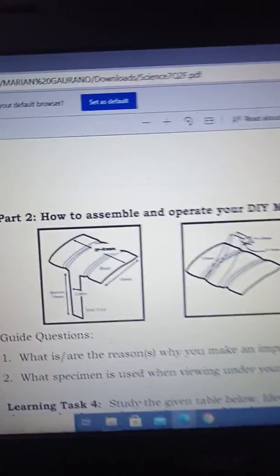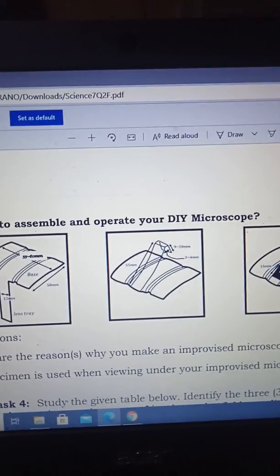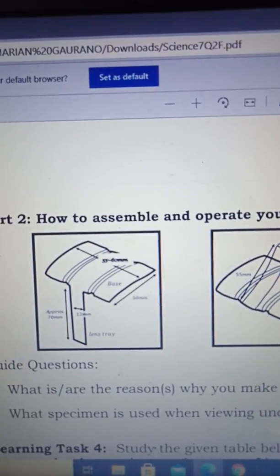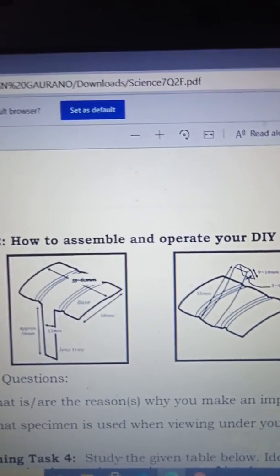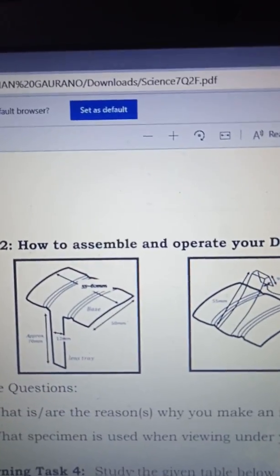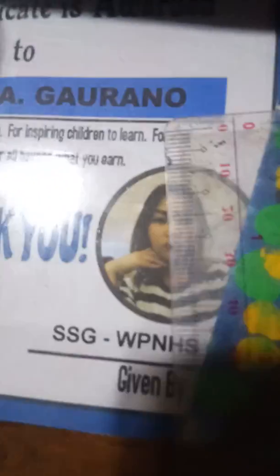Let's have Part 2: How to assemble and operate the DIY microscope. We have certain measurements, so using the ruler, let's measure. We all know that millimeters are used here — the small lines on your ruler. Each line is equivalent to 1 millimeter.